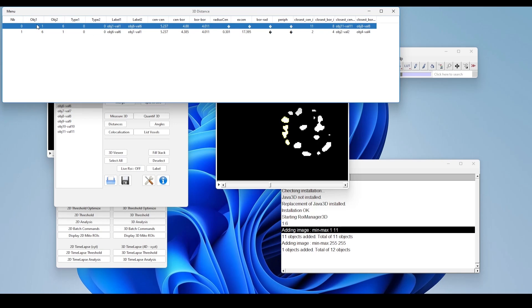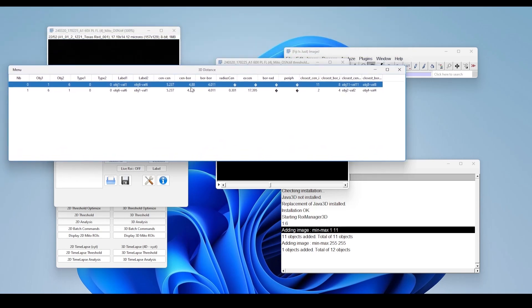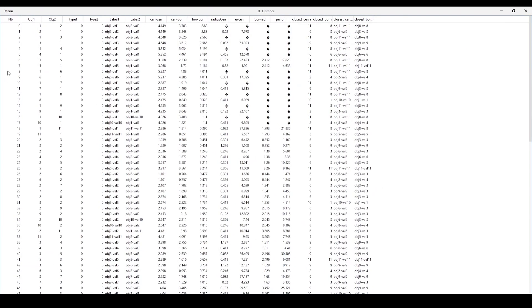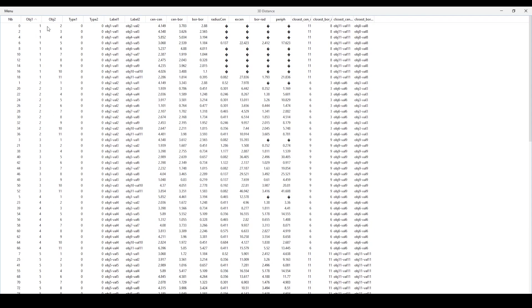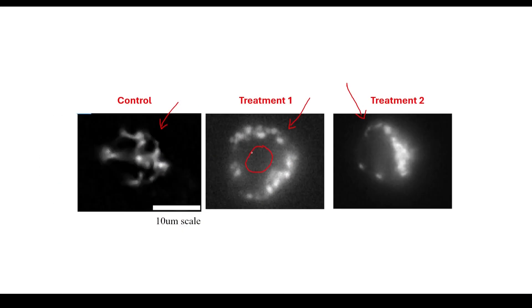You can get a wealth of information from all of this data. If you want to look at larger files, you can select all and sort out your data — individual mitochondria and their relationship to all other mitochondria in your file. You can also threshold your nuclei with a nuclear stain and understand the center-to-border relationship between all mitochondria. For example, if a treatment makes your mitochondria move further away from your nucleus, you can pick up on that by comparing images before and after treatment to see how mitochondria are shifting temporally and spatially.